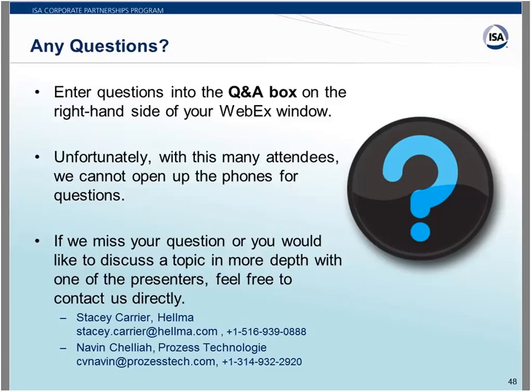While people are filling in the questions, there were a couple of questions that came in from the first section, and Navin, I think you're the appropriate person to answer this. The first question is, what is the limit of detection with spectroscopy for moisture measurement? There are two similar questions. What is the limit of detection for water in the process, and what is the range of application, in percentage moisture content, weight-based, for spectroscopy?